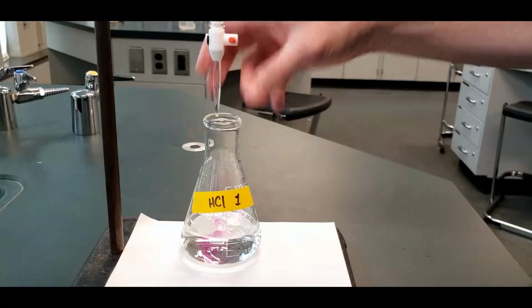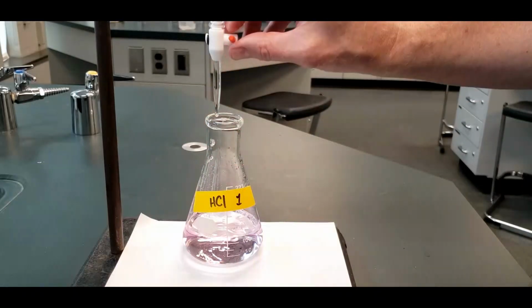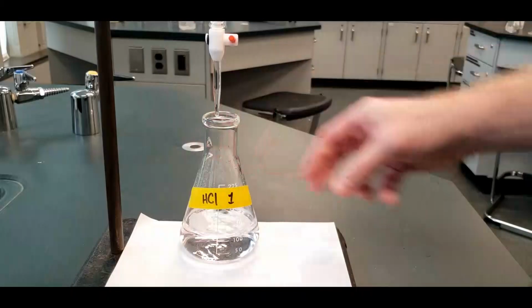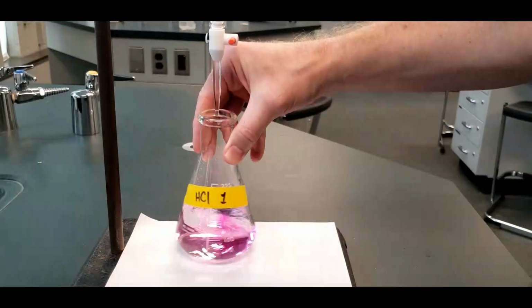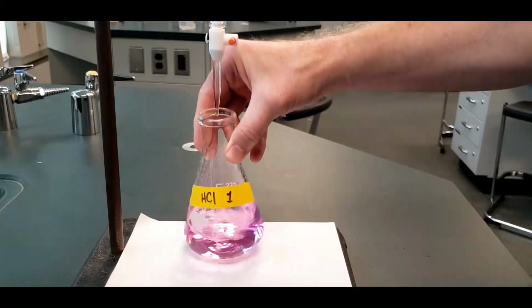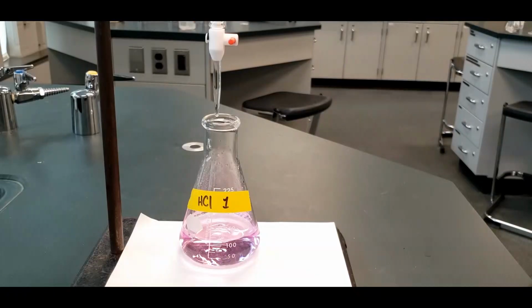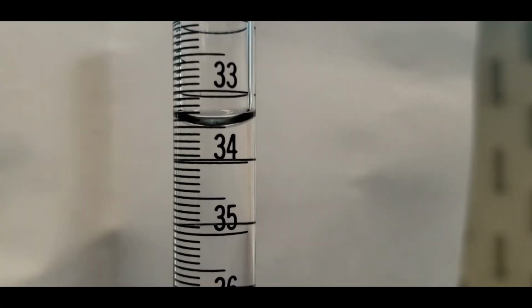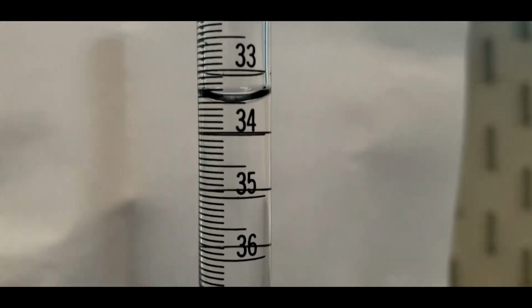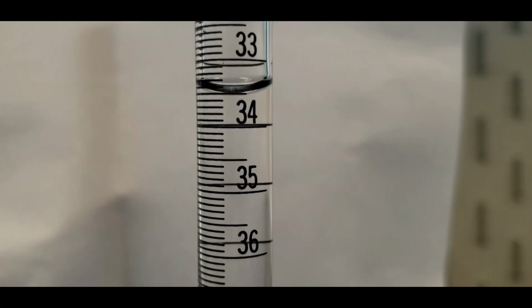And I didn't say it in the earlier video, but it shows it there, this is unknown 16. Oh, color stayed. Yeah, can't quite see it. There we go. And that was really just a couple of drops and it made all that difference. Okay, so that is the end of the titration. And here's the final volume for the HCl unknown. Looks like 33.49.